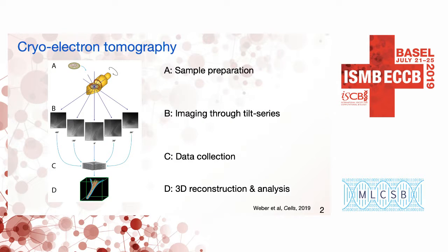The information of macromolecules' native structure and spatial organization has been very difficult to obtain. The recent advances in cellular electron cryo-tomography have made the acquisition of such information possible. This is an in situ 3D imaging technique which images subcellular structures through tilt series, which are later reconstructed to 3D tomograms.